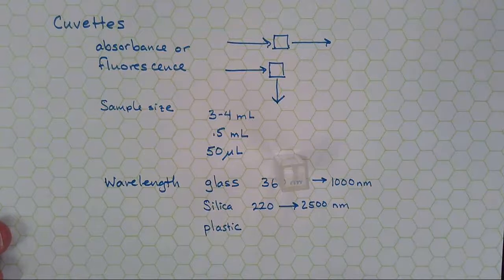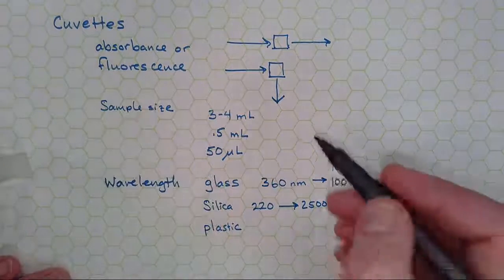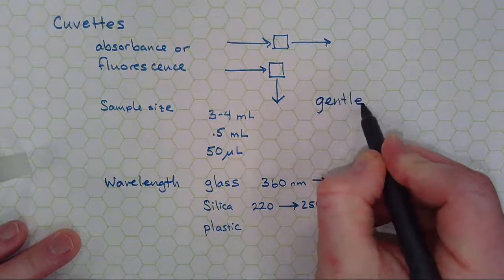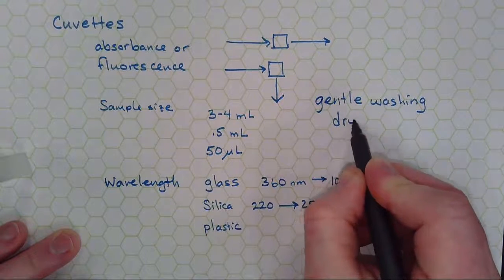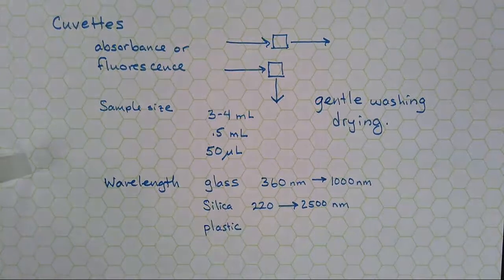Use gentle drying techniques. So I'm going to write that down, another note here, just so it's documented. Gentle washing and drying.